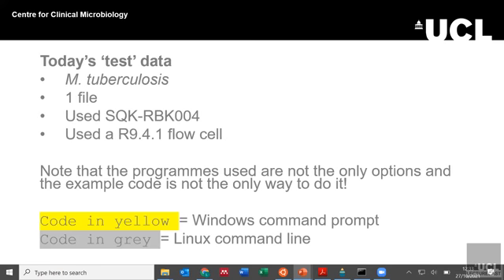So I've put together some test data. It's tuberculosis data. For the purposes of training, it's just one file because if I did any more than that, it would take forever, and we don't want to be sitting here forever.